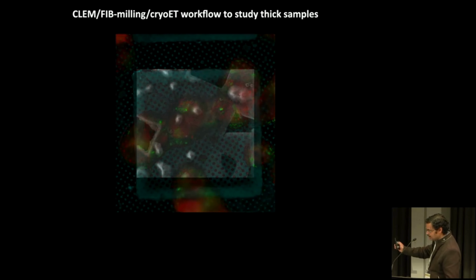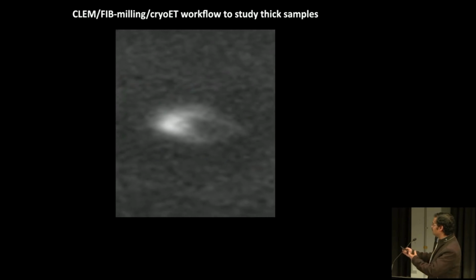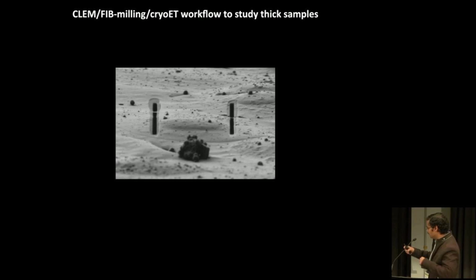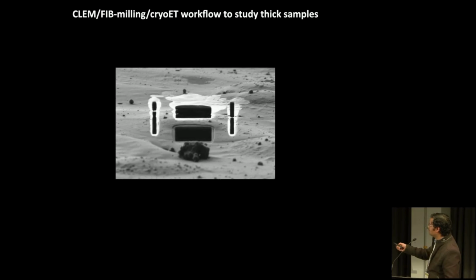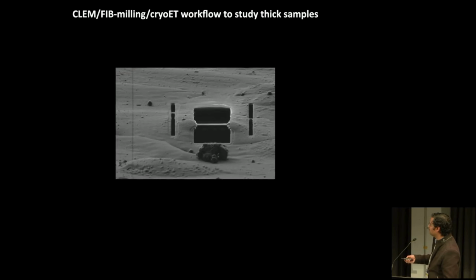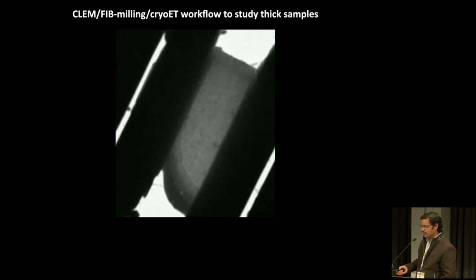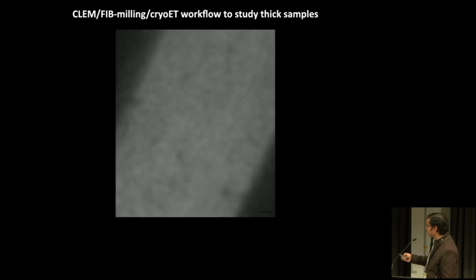Okay, another thing I wanted to mention is that if you have thick samples, for example eukaryotic cells or really thick microbial cells, then we can combine tomography with another imaging modality, which is called a focused ion beam instrument. With that, we can make a thin slice of your sample, and then that sample can be taken for tomography, and then we can start getting high resolution information.